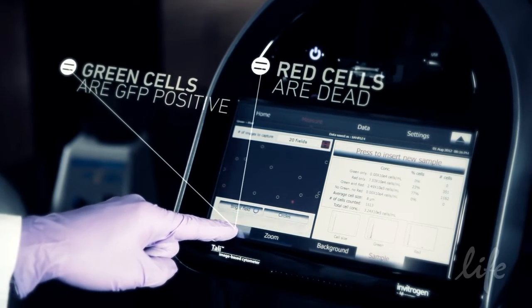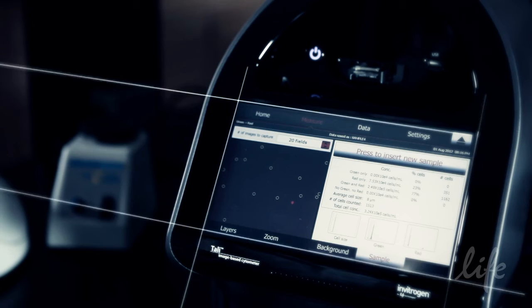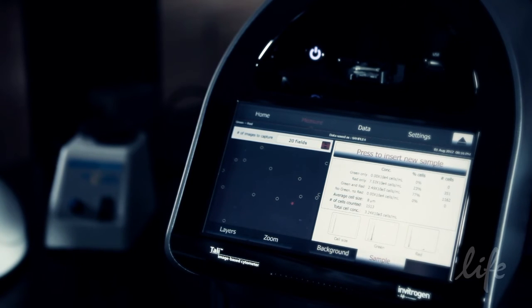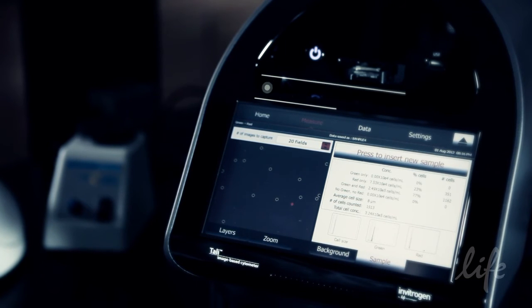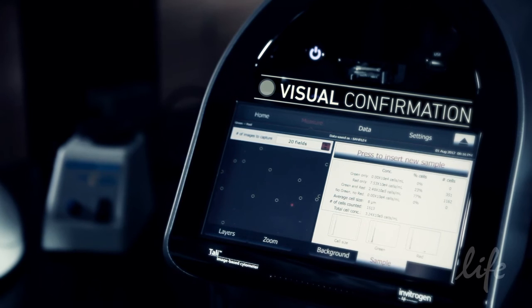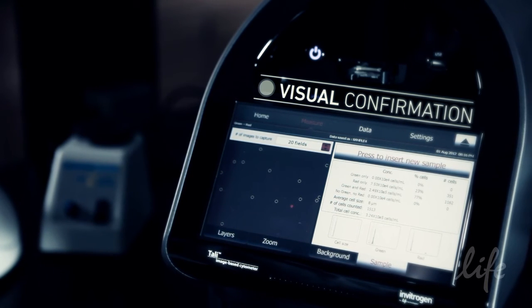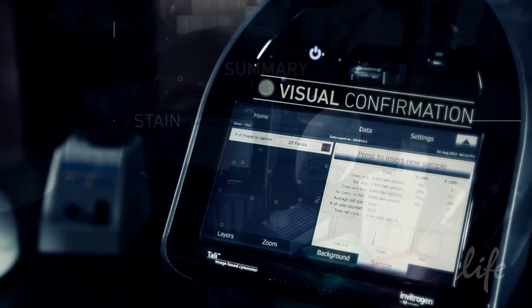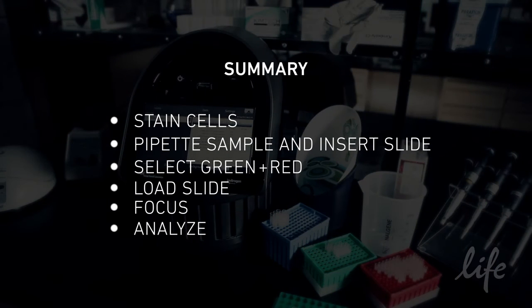The histograms for cell size and fluorescence intensity for green and red channels are also displayed and can be adjusted. The results can also be visually confirmed by examining the images of the captured fields of view. The small yet powerful Tally image-based cytometer offers quantitative analysis with visual confirmation, making it ideal to simultaneously assess transfection efficiency and viability. For more information, visit lifetechnologies.com/Tally.